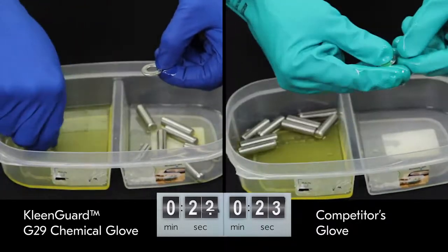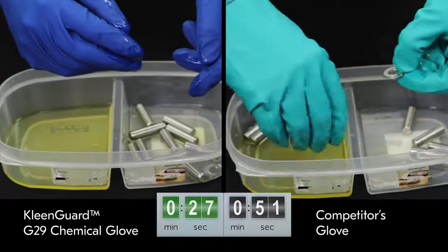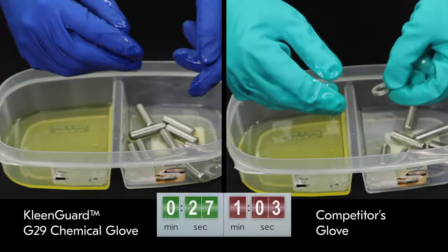But when it comes to dexterity, there's no compromise. The G29 Chemical Glove allowed our worker to easily complete the task — and faster.